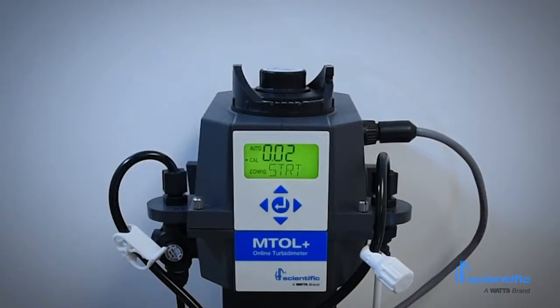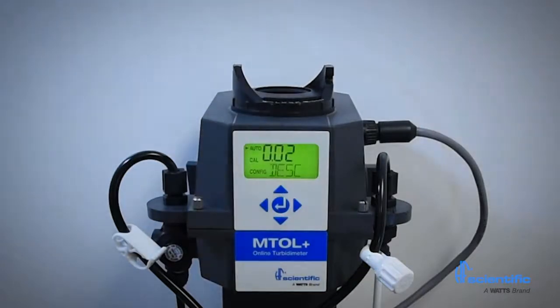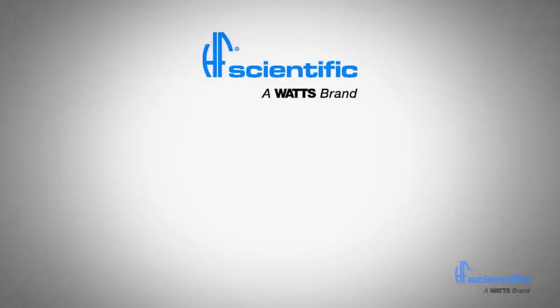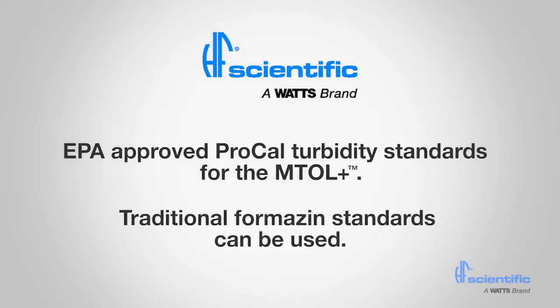The calibration is now complete. The MTOL Plus will automatically enter auto mode for routine turbidity measurement. The MTOL Plus only stores successful calibrations. If a calibration fails, the instrument will use the last valid calibration. HF Scientific manufactures EPA-approved ProCal Turbidity Standards specifically for the MTOL Plus. Traditional formazin standards can be used if desired.